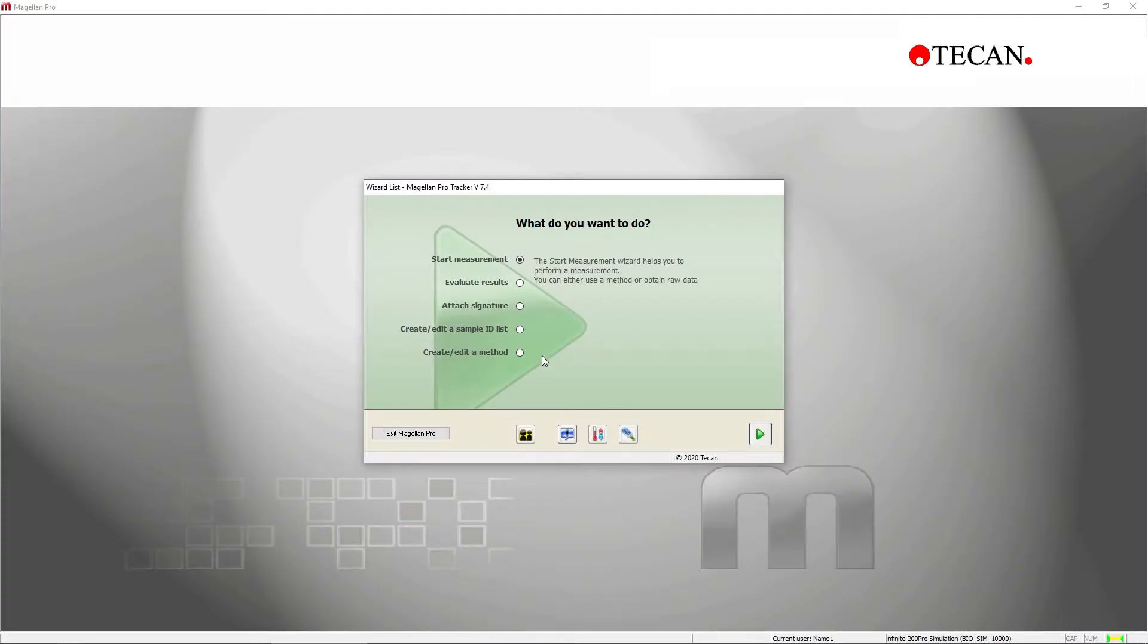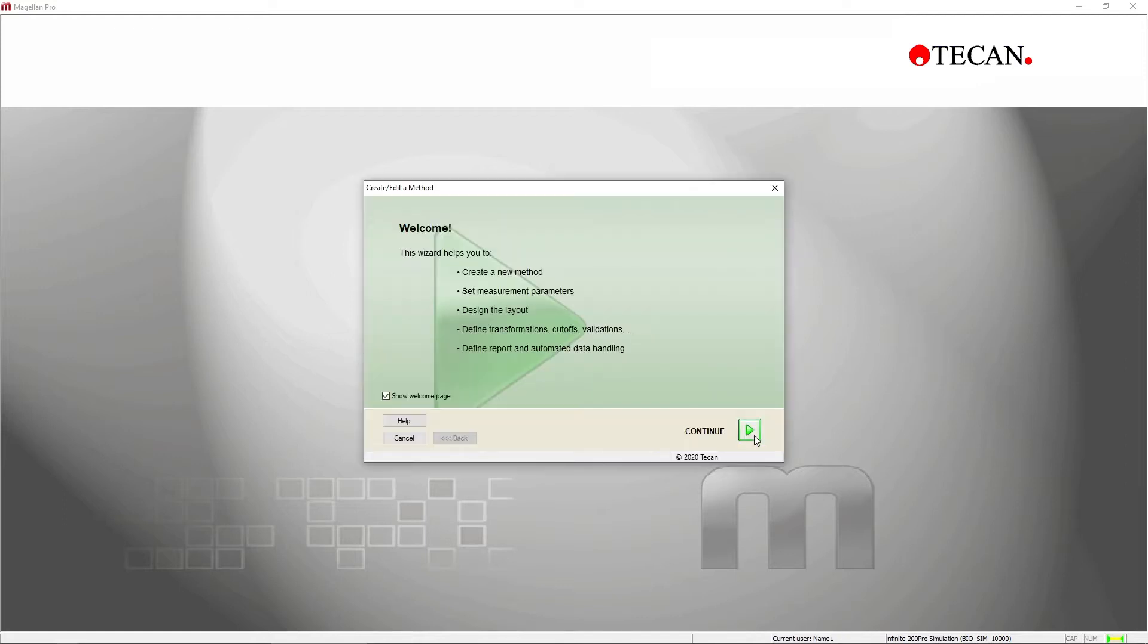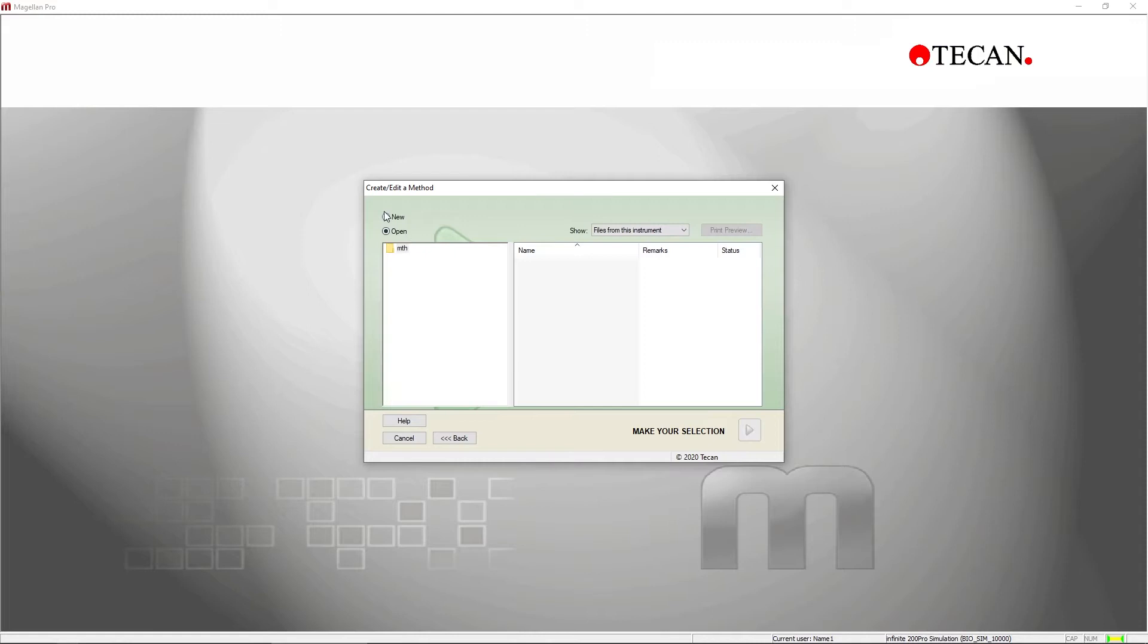To set up a quantitative measurement, click Create slash Edit Method, then select New and confirm your selection to open the method editor.